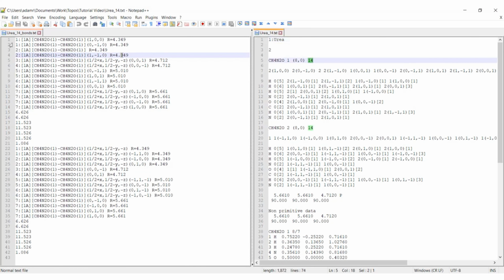With 14 neighbors, we've got 14 interactions here. So you can see you've got 14 lines here, which correspond to 14 interaction types. But these are now divided into different interaction types. If some interactions are the same based on symmetry, the point group symmetry of your molecule, they'll be assigned the same number. So you can see we've got 2 interactions of type 1, 2 of type 2, 1 of type 3, 1 of type 4, 2 of type 5, 2 of type 6, and 4 of type 7. Those 4 are actually the ones that are removed when we increase the strength cutoff using omega.